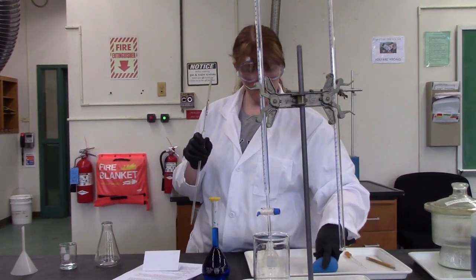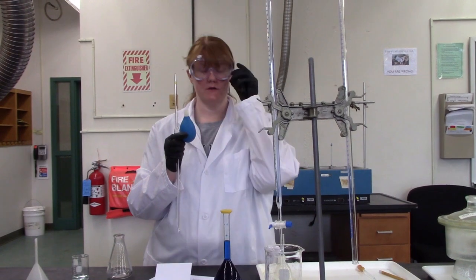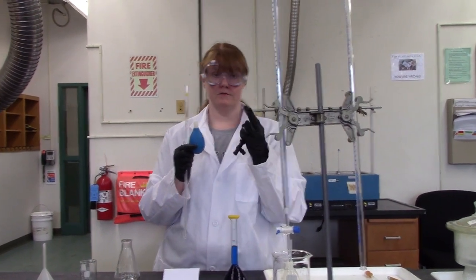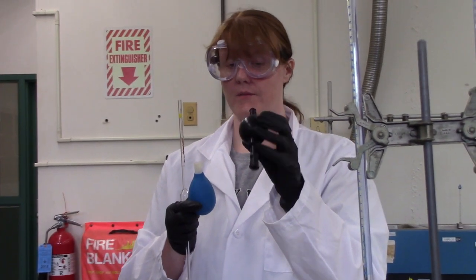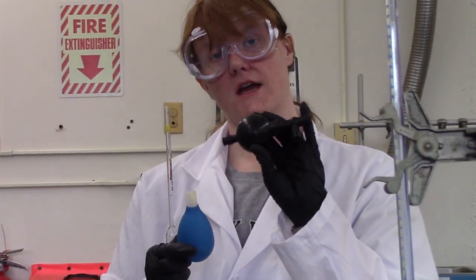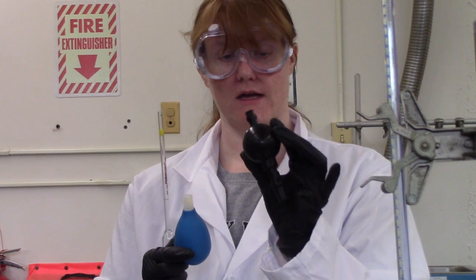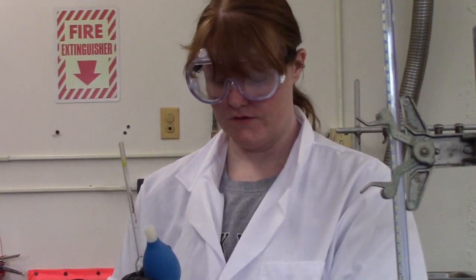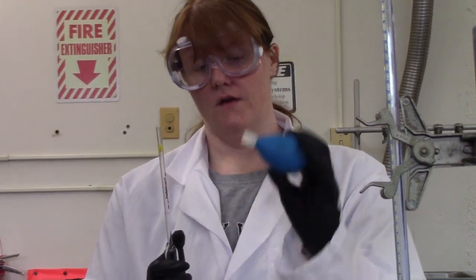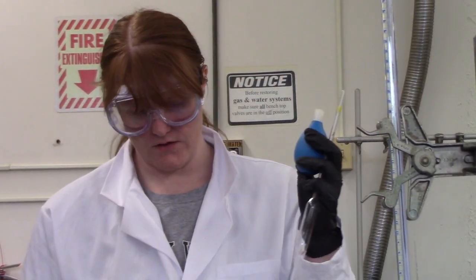There are two different kinds of bulbs, and which one you choose is going to depend on your personal preference. These ones have ball valves, so if you have relatively strong hands, most people in that category prefer these ones. They're easier to manipulate in terms of dexterity. These ones don't require as much strength, but they do require a little bit more finesse. So it kind of depends. Try them both, see which one you like.